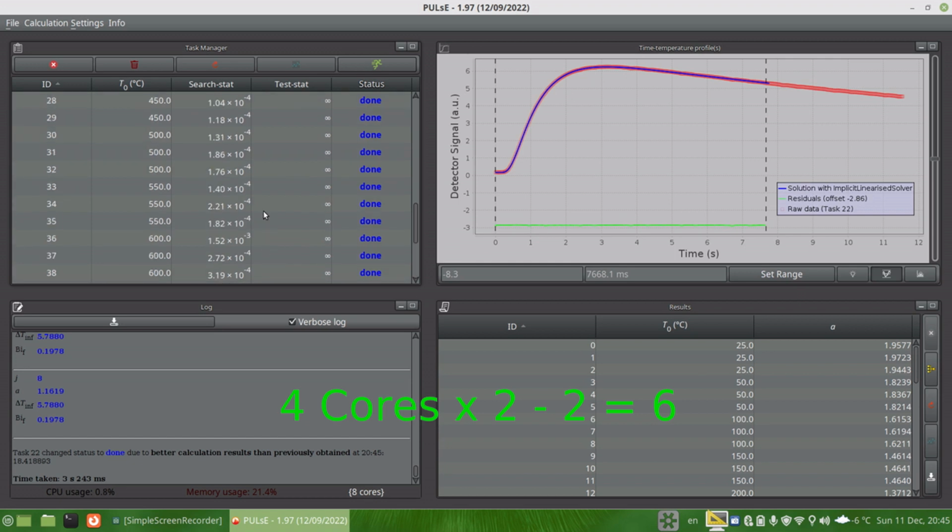When this calculation is done, you might have also noticed that the CPU usage rises to high values of maybe 70-80% or maybe even higher, and this is directly reflected from the fact that the different cores on your machine are being used for calculation.